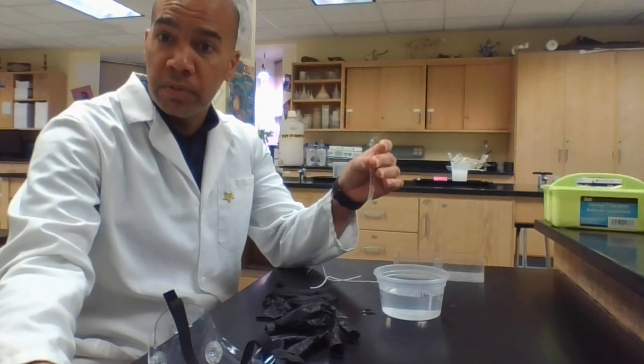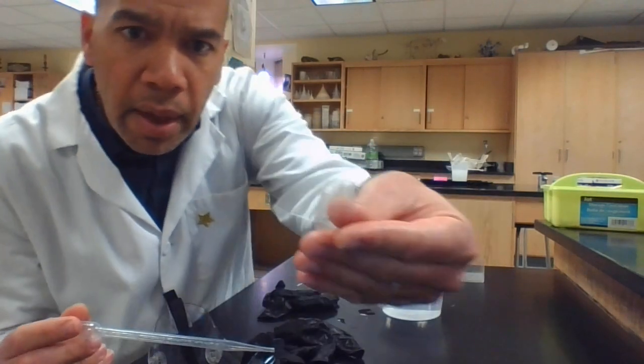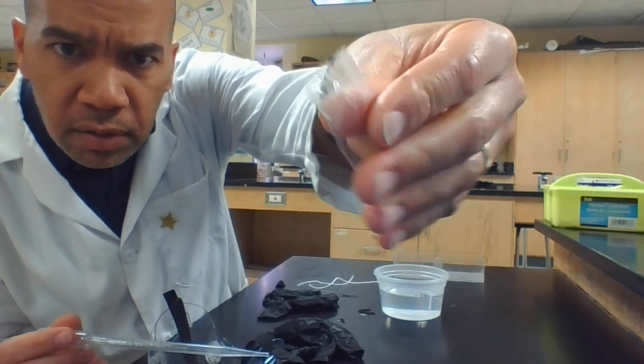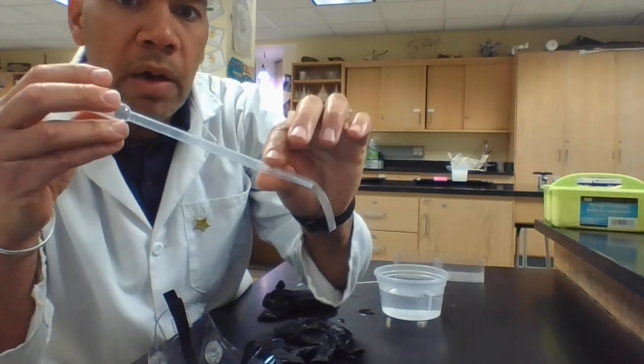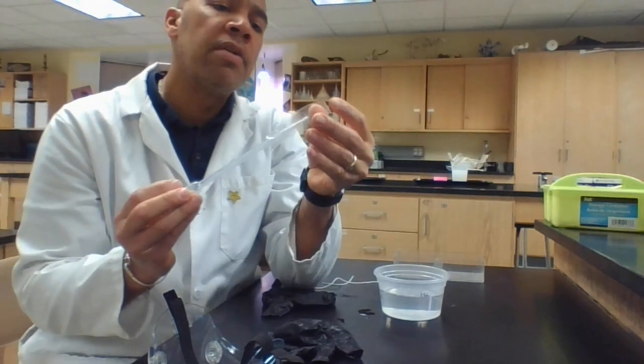So let me go grab my pipette so we can do that. Okay, so what you can see here is I've got the bag open just a little bit. It's hard to see, but this will allow it to open a little bit more. Now, I don't want to go all the way to the end because this next procedure is important.